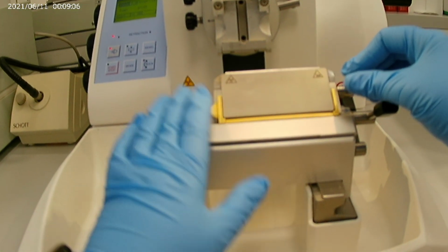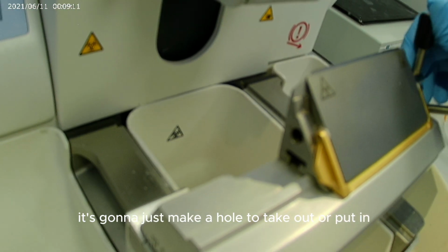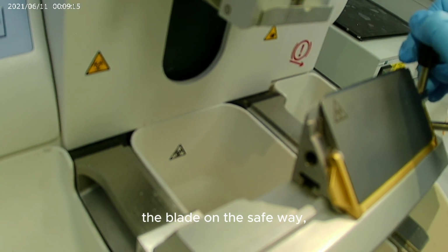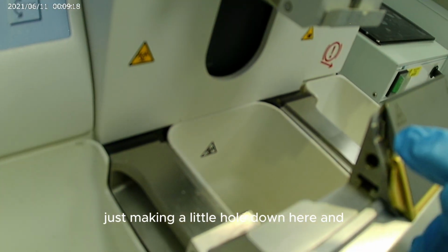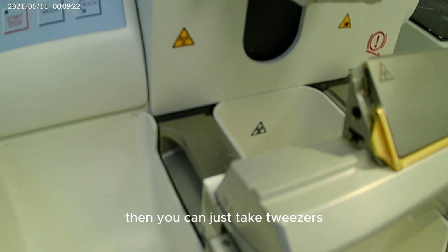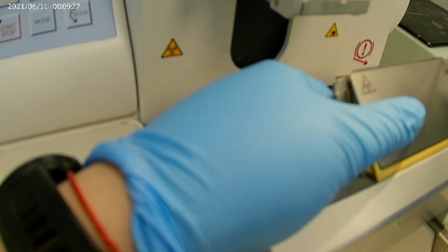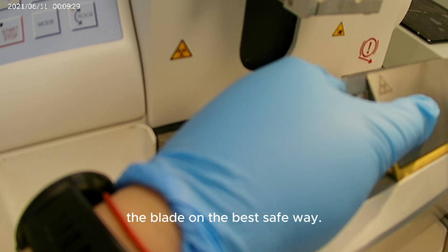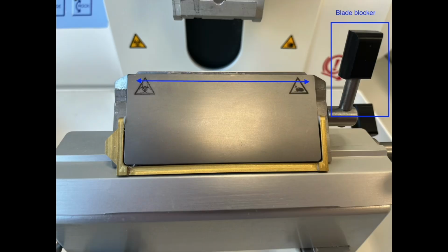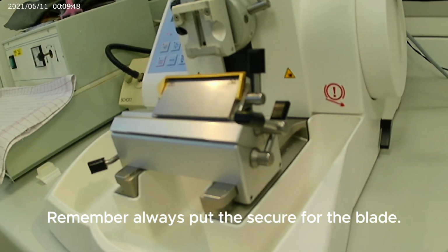This other is gonna just make a hole to take out or put in the blade in the safe way. Just making a little hole down here, and then you can take tweezers and take out or put in the blade in the safest way. Remember, always put the safety cover on the blade.